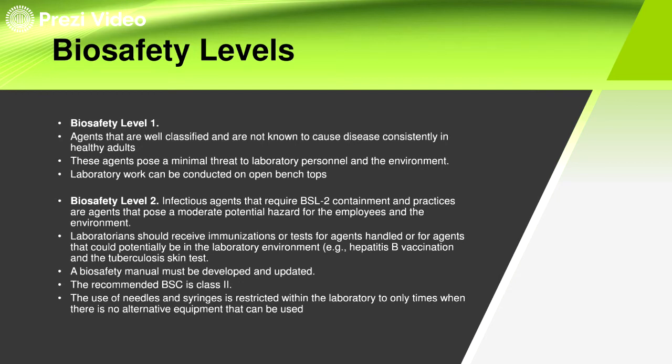Okay? So, for the biosafety level 2 microorganism, those are infectious agents that require the BSL-2 containment and practices are agents that pose a moderate or potential hazard to the employee and the environment. So, if you're going to handle this microorganism, dapat meron kang protection muna. So, usually, meron kang vaccination. So, yung mga healthcare worker, meron tayong Hep B vaccination and tuberculosis skin test na ginagawa. And then, of course, you have a manual, a biosafety manual that is developed and updated. So, dapat meron kang procedure or talagang standard processing method sa mga specimen.